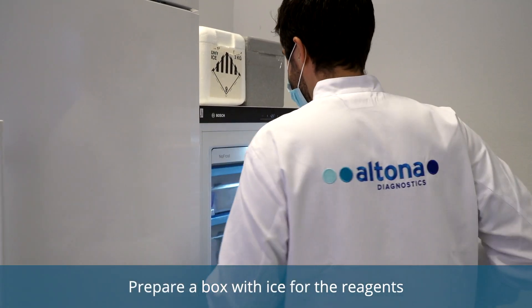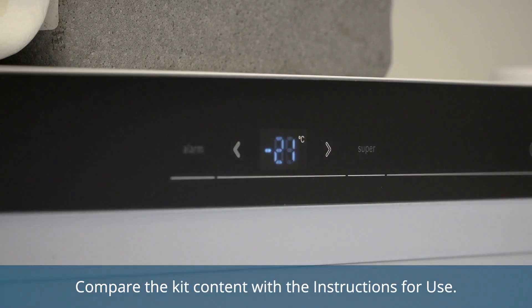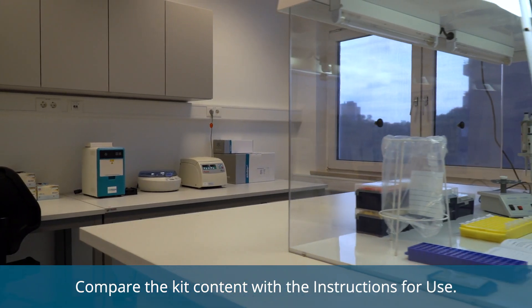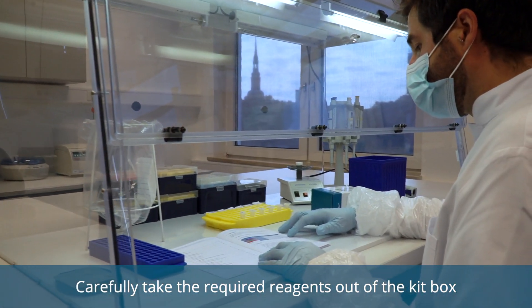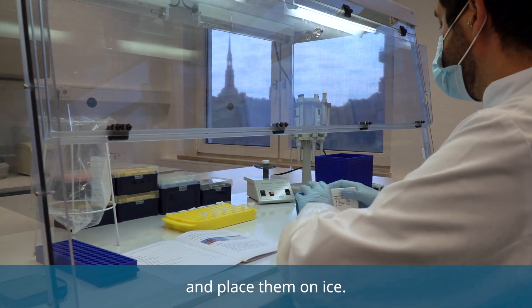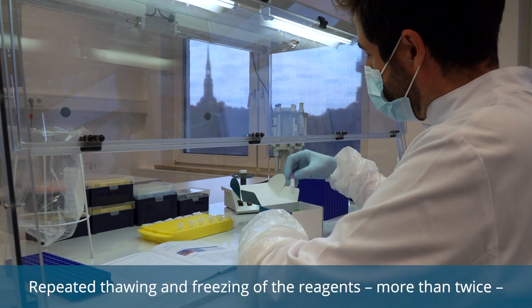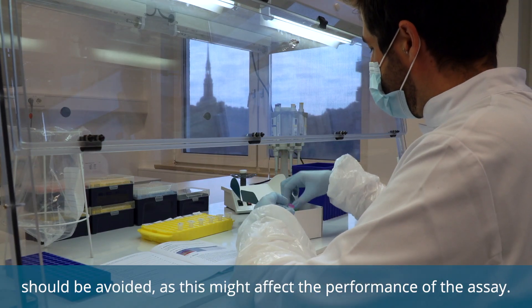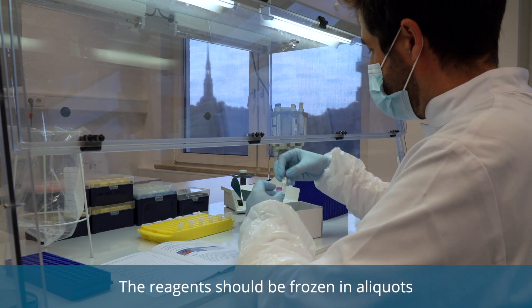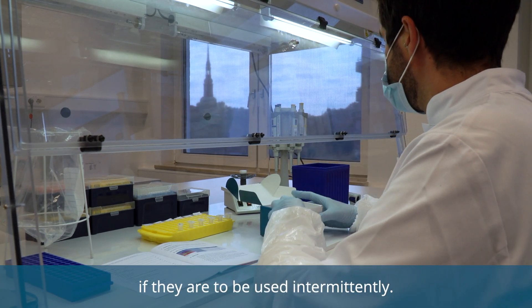Prepare a box with ice for the reagents before taking the RealSTAR kit out of the freezer. Compare the kit content with the instructions for use. Carefully take the required reagents out of the kit box and place them on ice. Repeated thawing and freezing of the reagents, more than twice, should be avoided, as this might affect the performance of the assay. The reagents should be frozen in aliquots if they are to be used intermittently.